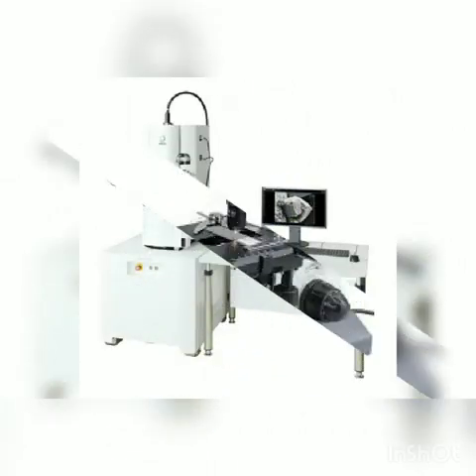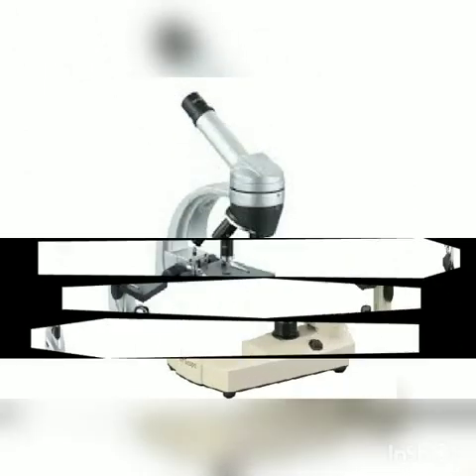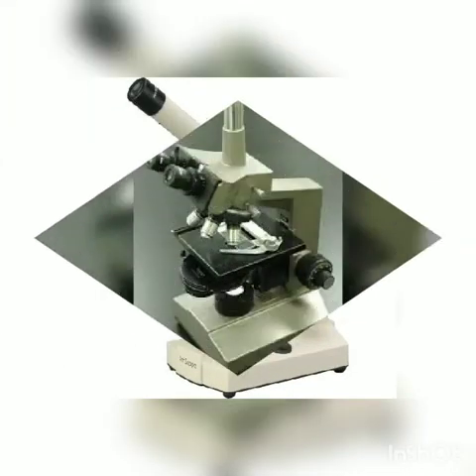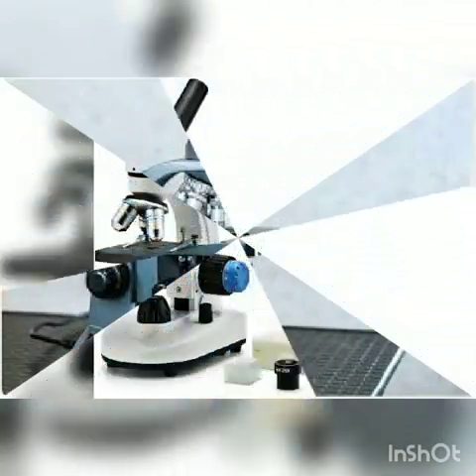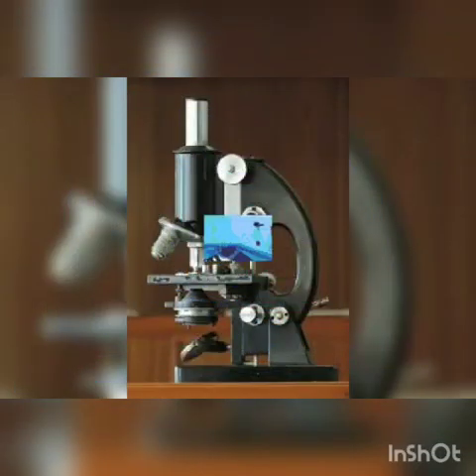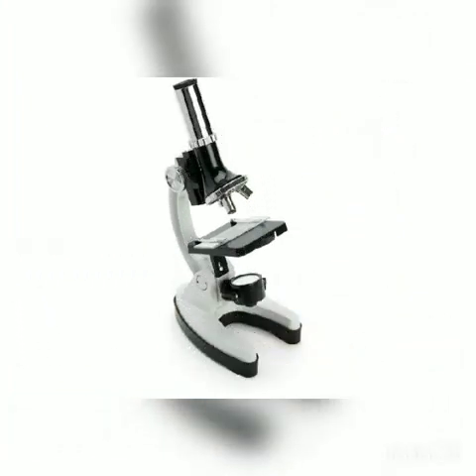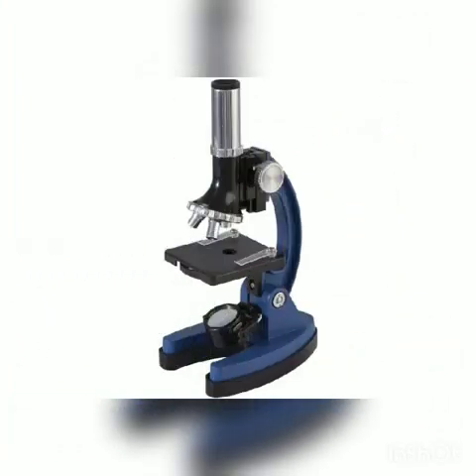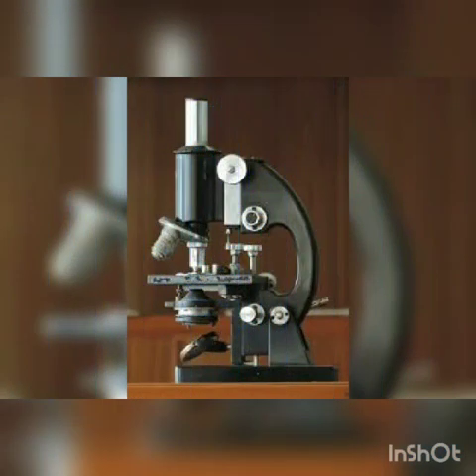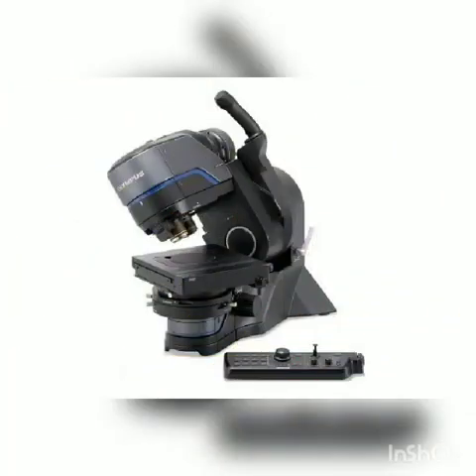The most common microscope is the optical microscope, which uses light to pass through a sample to produce an image. Other major types of microscope are the fluorescence microscope and the electron microscope, the scanning electron microscope, and the various types of scanning probe microscopes.